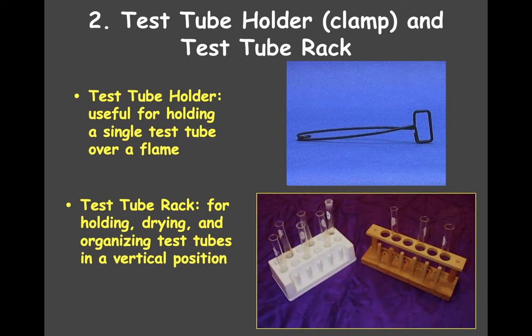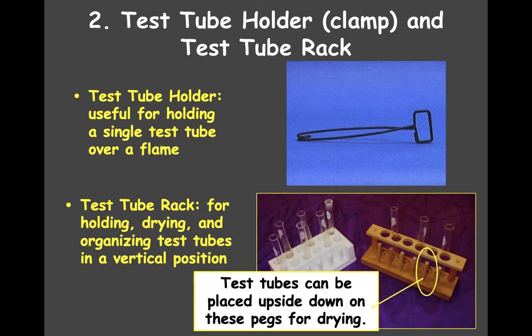It is important when you're using test tubes and the test tube holder to point the top of the test tube away from everyone. You don't want something to shoot out the end of it.